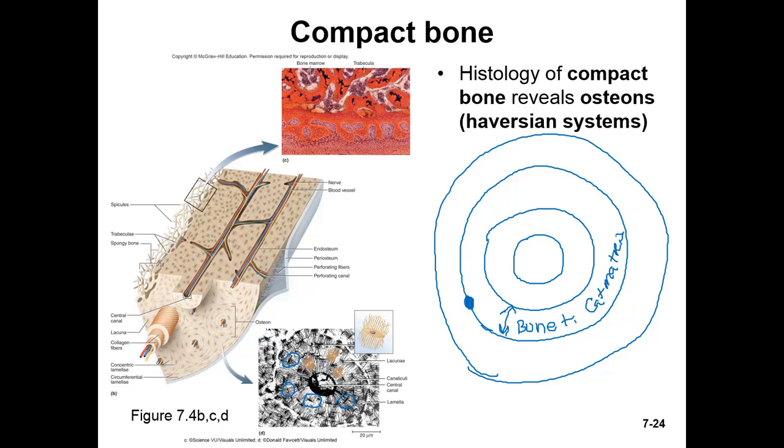Well, in those dark areas, the dark areas are hollowed out cavities called lacuna. And in lacuna, we were calling these the cocoons in class, or the hollowed out areas or cavity. That's where the osteocyte sits. And the osteocyte, if you remember the pictures of it, almost looks like an eye with these really long eyelashes, the osteocyte. So an osteocyte would be in between these two lamella, and its really long eyelashes would go this way.